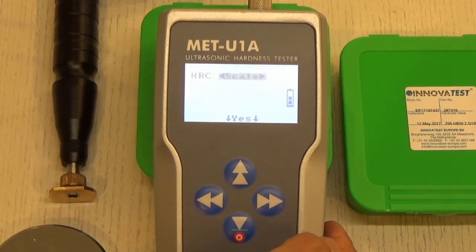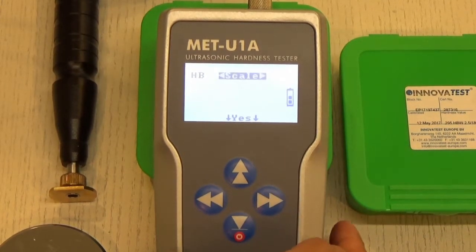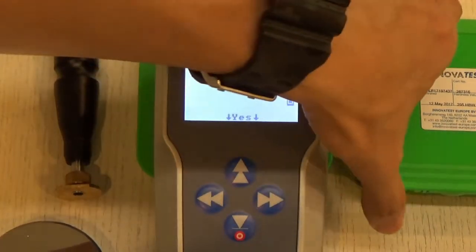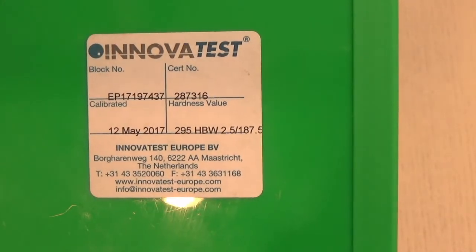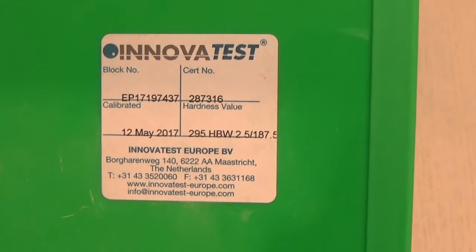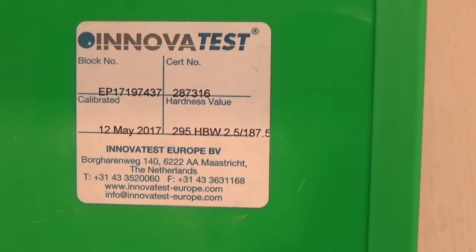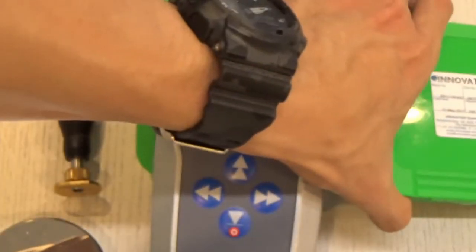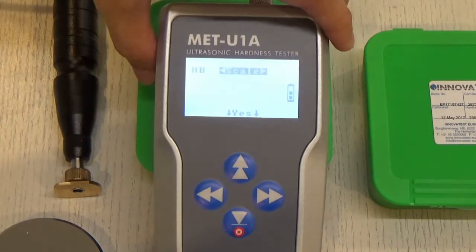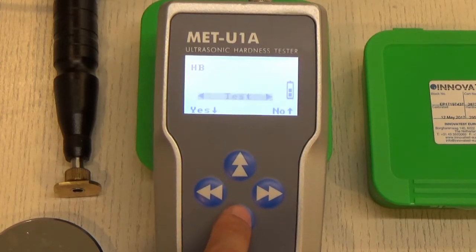We also have the HRC Rockwell C scale as well as the Brinell HB scale. Today we are going to test with this test block from InnovaTest, which uses the Brinell scale with a hardness value of 295. We will select the Brinell scale by pressing the down button.